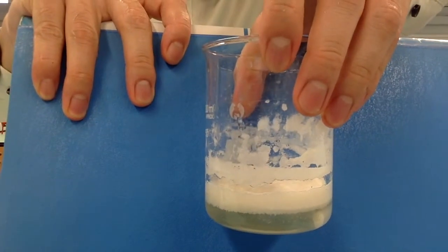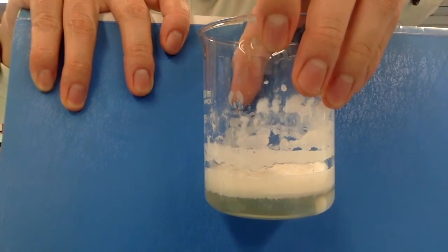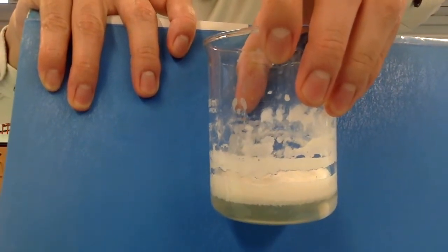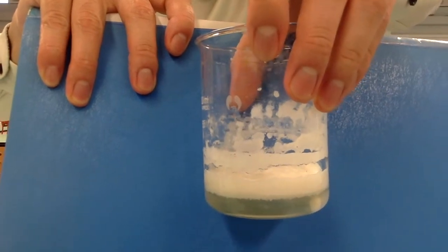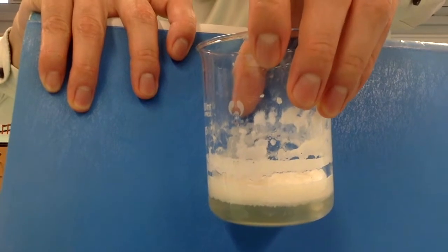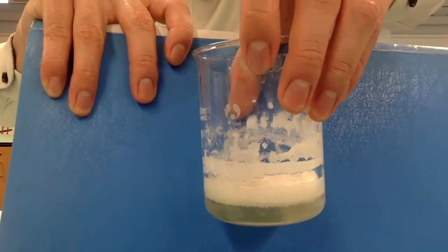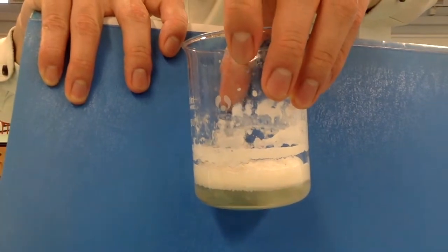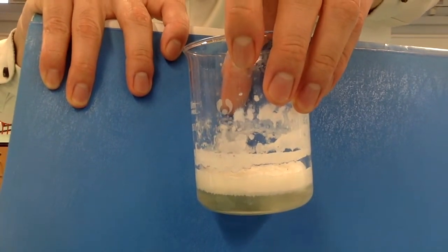Now, this is how the appearance of the product looks like. The soap is the white solid that is floating on the surface, while the liquid at the bottom is the saturated sodium chloride solution. Now, we are going to carry out a filtration to separate the white soap from the mixture.